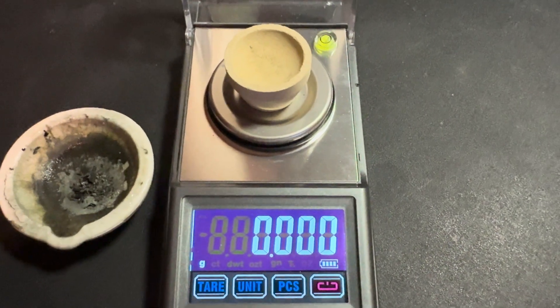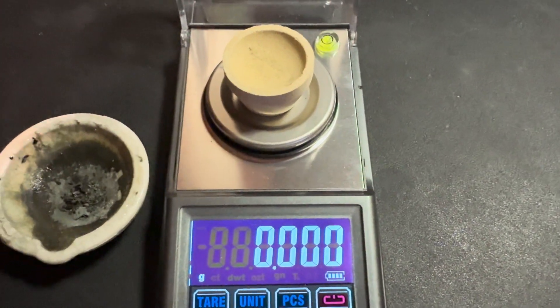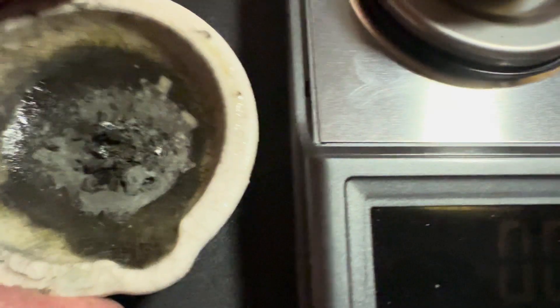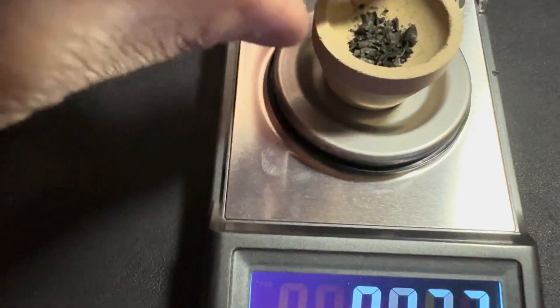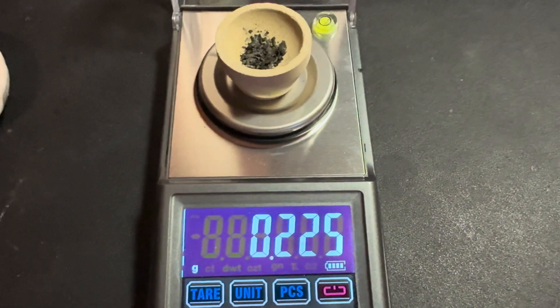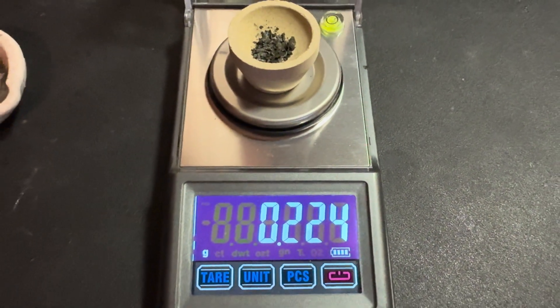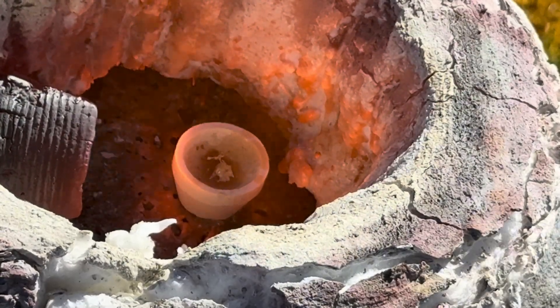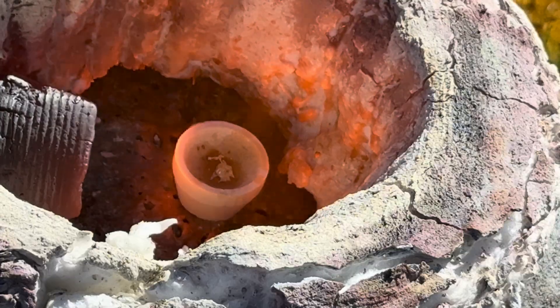We did get our Gold Canyon gold out of the beaker and into this dish. We got it dried out and now we are going to weigh it up. And we have 0.225 — 0.224 of a gram.